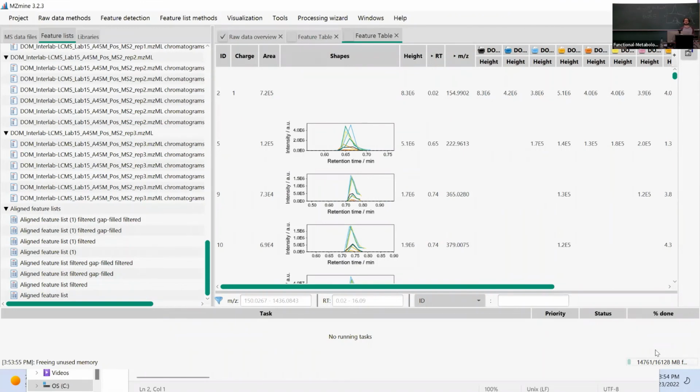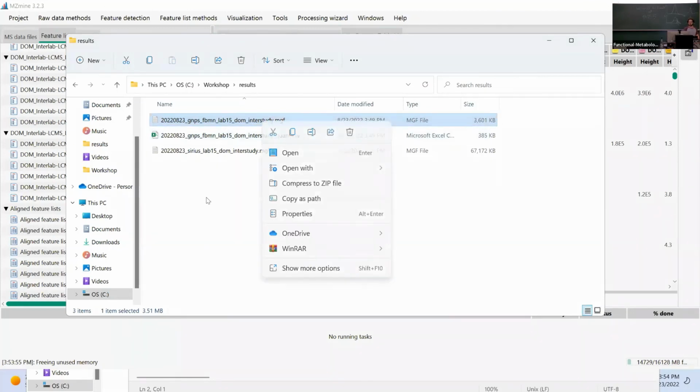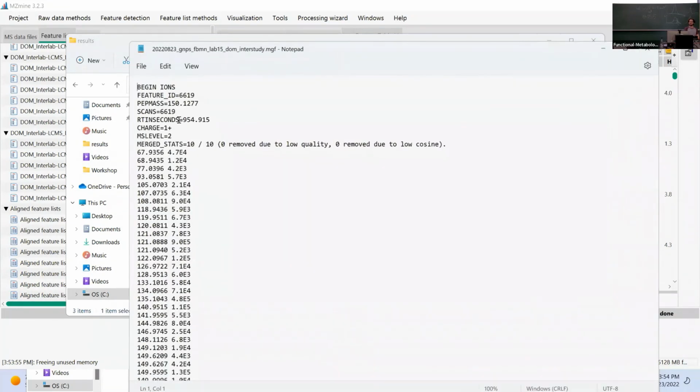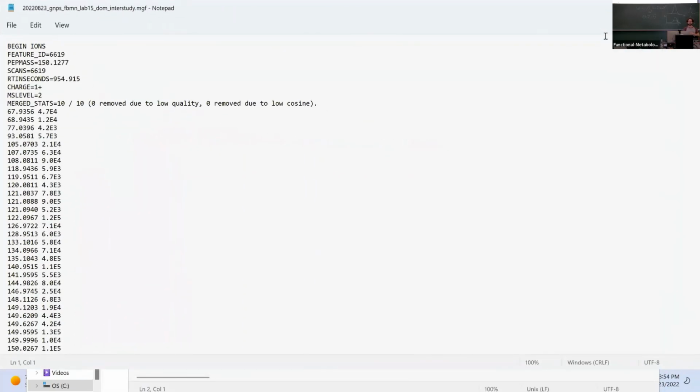Okay. So everyone should have those files now, right? Yeah. So let's see. Just to show you what kind of files we now produced. I'm just opening the MGF in any text editor. The data exchange format here is just text-based, so it's very easy to parse and also to understand by humans.